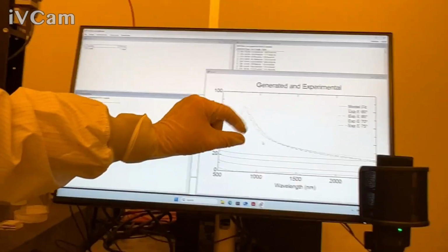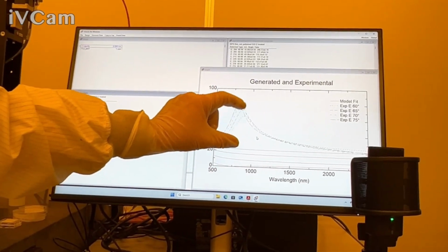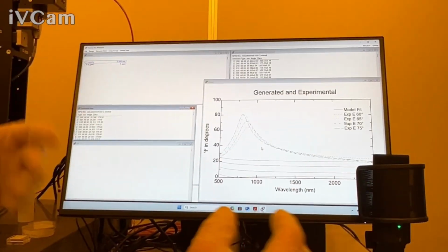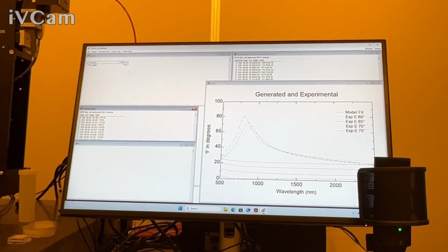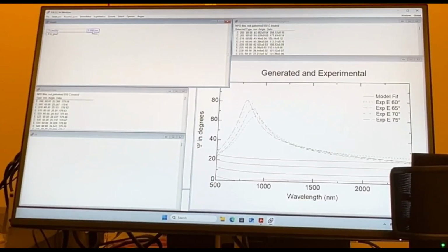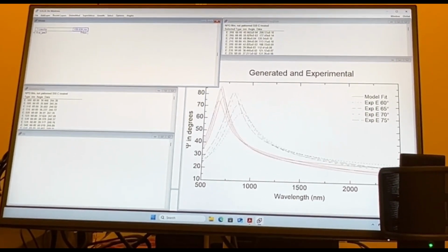The other one is your optical contrast. If this is a very, very large index difference, the more index contrast you have, the bigger these peaks are going to be. If it's transparent, the closer the index, the smaller they are. So I just want to show how you can mouse roll that too. So we'll go back. Again, we could just tell this to fit and see where it wants to go. It's kind of demonstrating that a little bit.